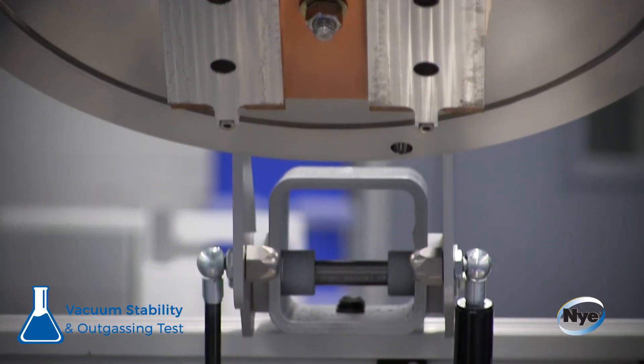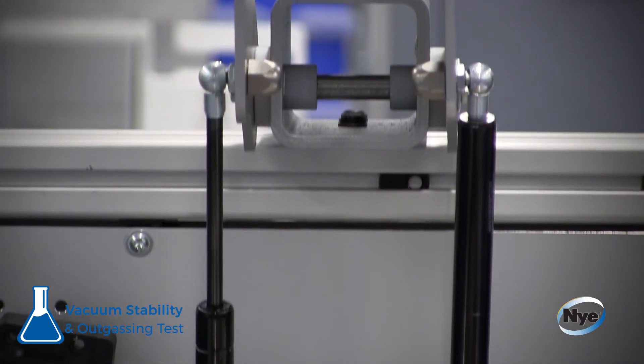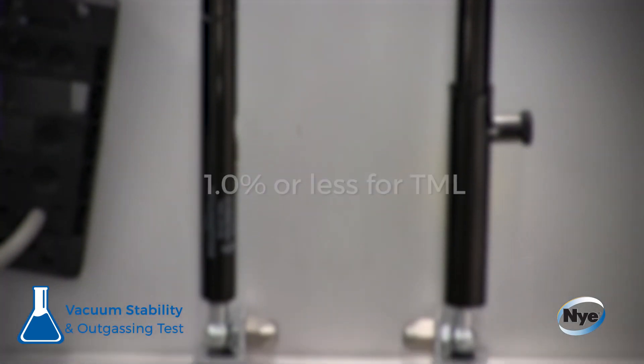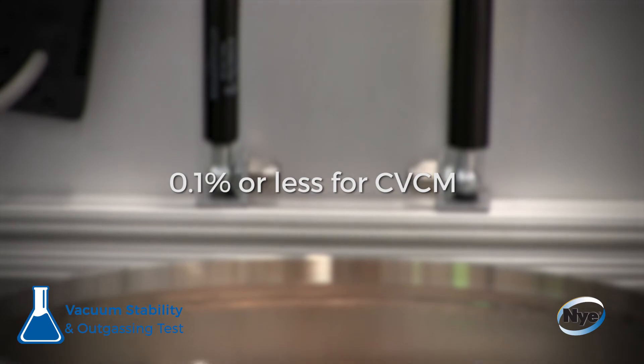Historically, the acceptable limits determined by NASA and adopted by other industries are 1% or less for TML and 0.1% or less for CVCM.